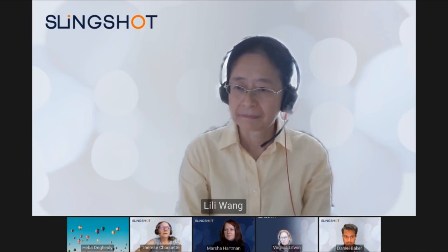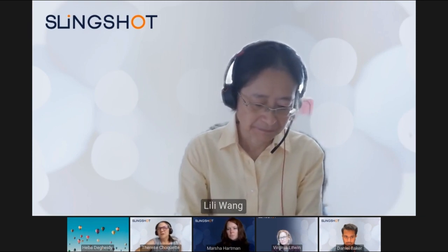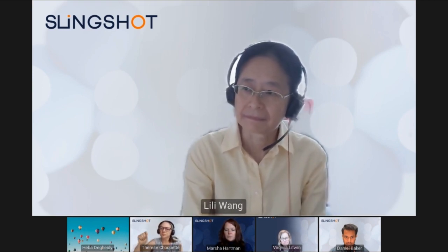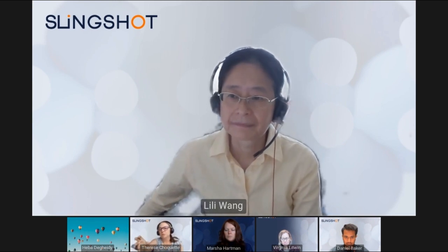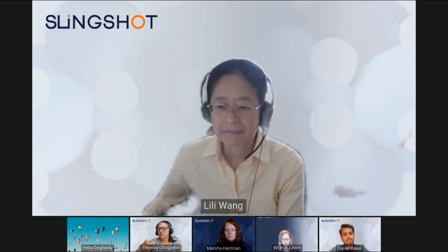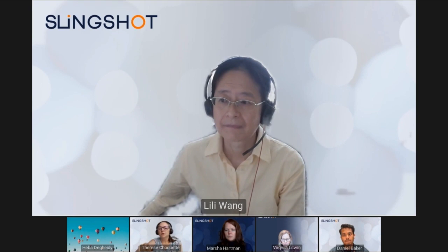Go ahead, Therese. No, that is a really sharp observation, and that's why we tested it both on the hyper beads as well as mixed with our cells, just to see what the difference was. I think it's important to have control of your instrument and the linearity. You can do that with fluorescent particles. But in regards to the assay, you need to use your cells of interest, and then you can use the slingshot cell mimics to dilute them, because you need to dilute them out, so to say.